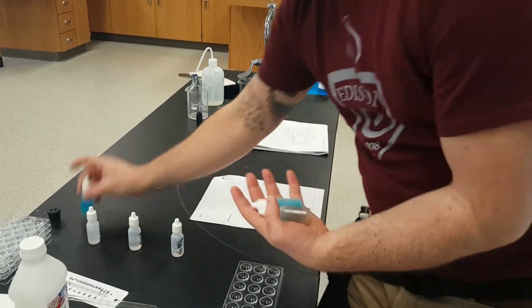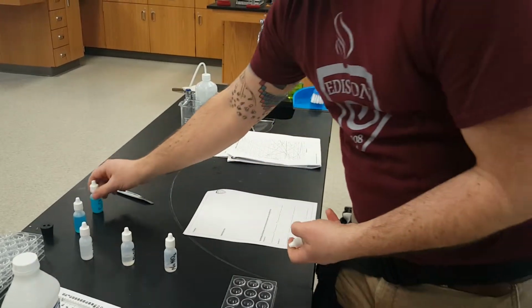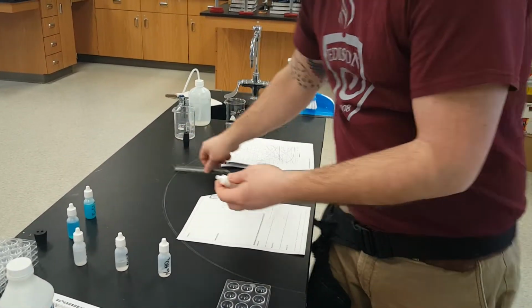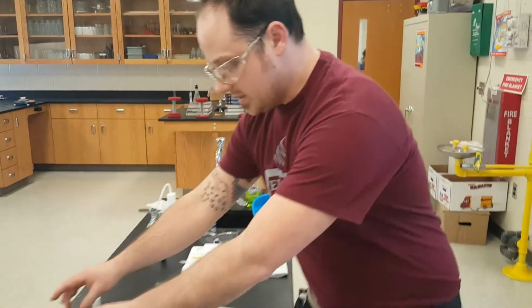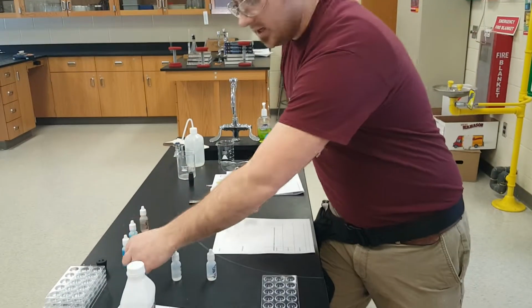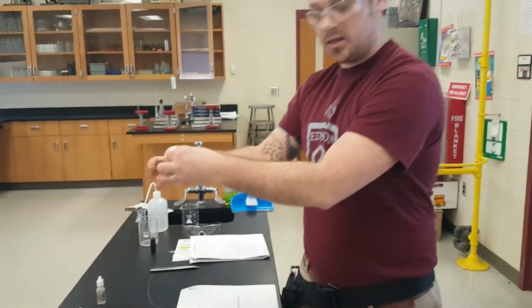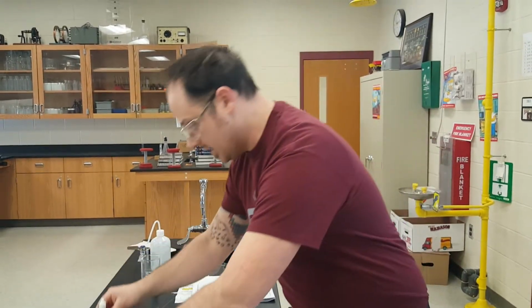So there we go. Notice I'm setting these up in what would be considered a Punnett square, if you remember biology, the traits and the stuff. What I'm going to do is take these first two, mix them together. Then I'm going to take the first one and the second one, mix it together. Then I'm going to take the first one and the third one, mix it together.